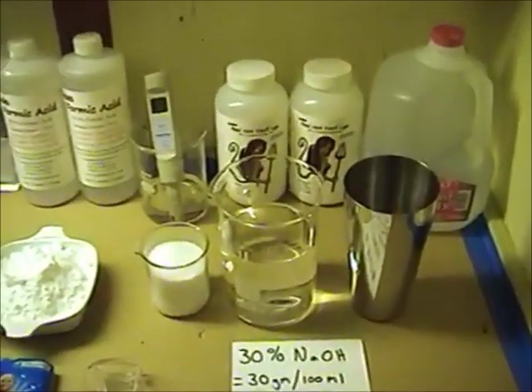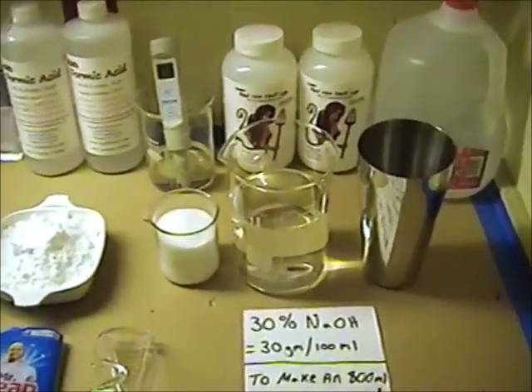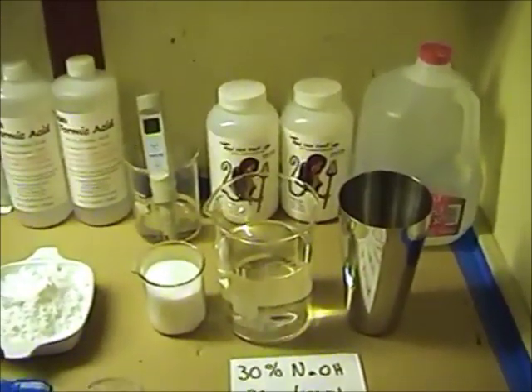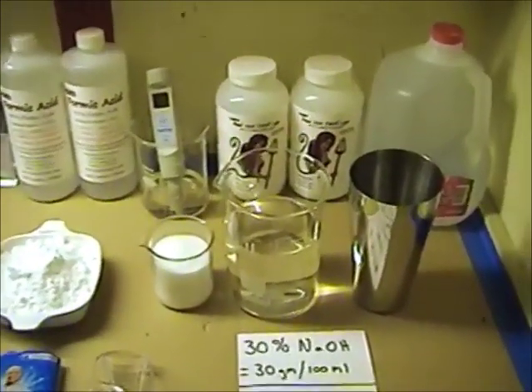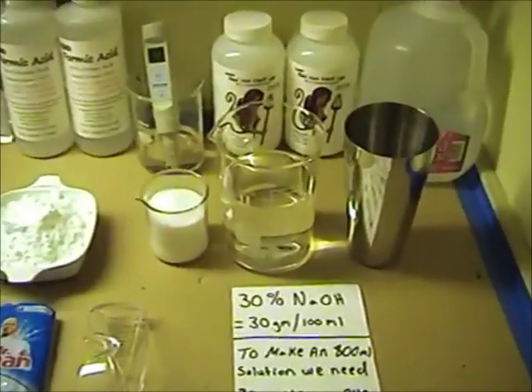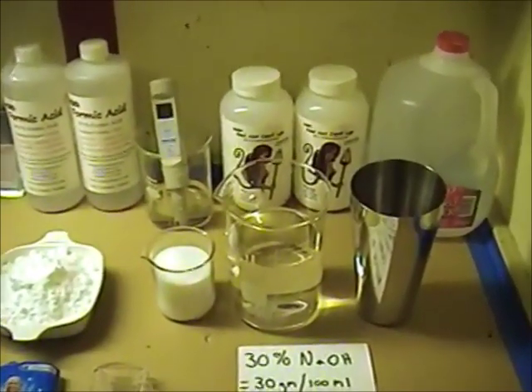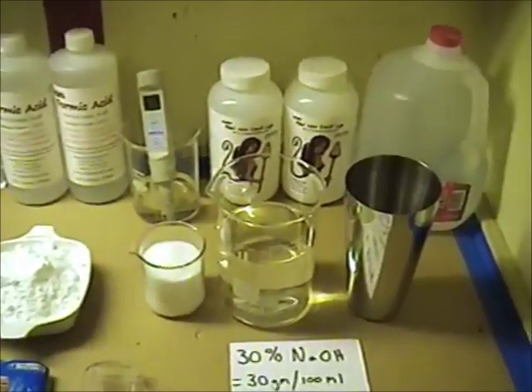And hot sodium hydroxide is not something you want on your skin, and you definitely don't want it in your eye. If you have a splash of acid in your eye, the cornea of your eye will repair itself most times. If you have a splash of this hot sodium hydroxide hit the cornea of your eye, it will kill the tissue in that specific part of the cornea, and it will not regenerate itself. So do not take the sodium hydroxide lightly. To me, it's the part of the step that scares me the most. But like anything, you have to respect it and use the proper handling and safety precautions, and you'll come out just fine.